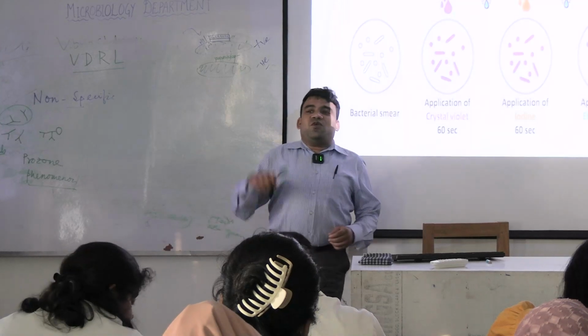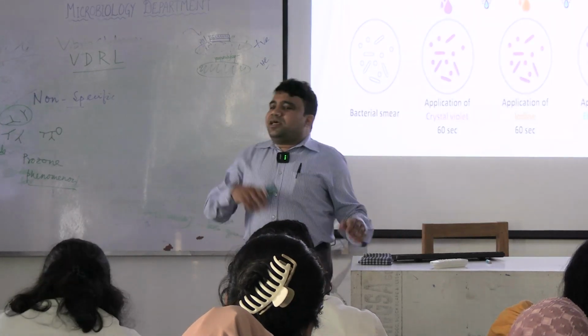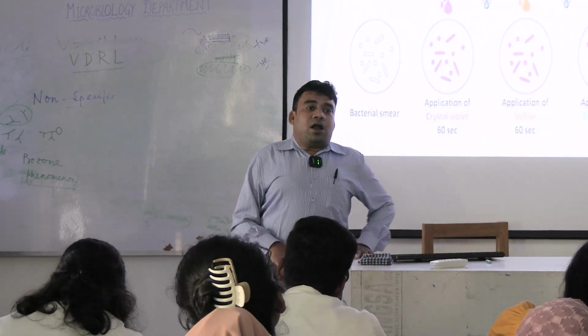So what will happen if you over decolorize? Gram positive will appear as gram negative. What will happen if you under decolorize?